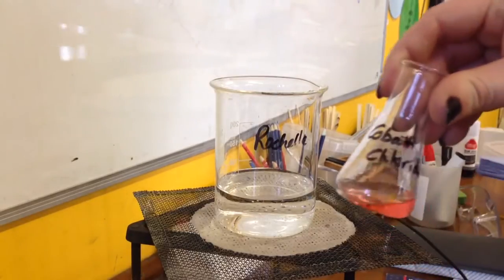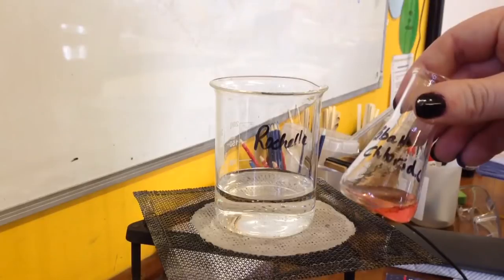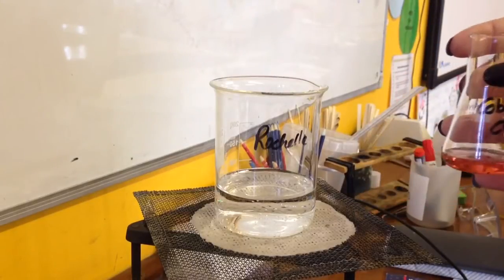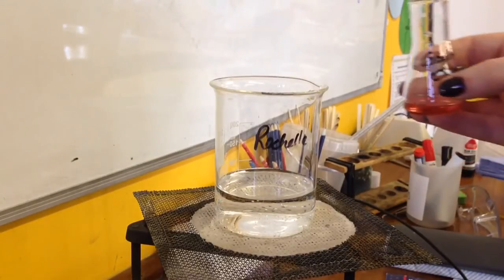This is our catalyst via cobalt chloride. You can see the cobalt chloride is a pink color and it's the color that I want you to pay attention to in this reaction.